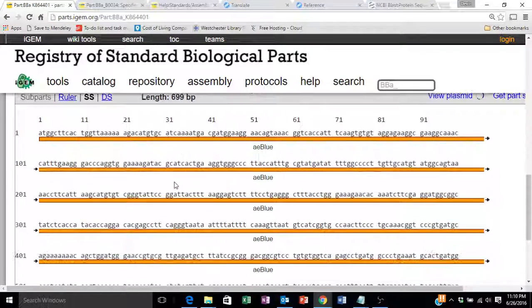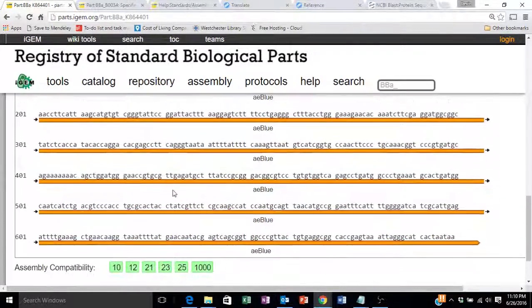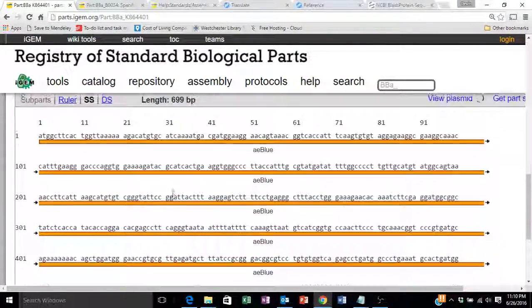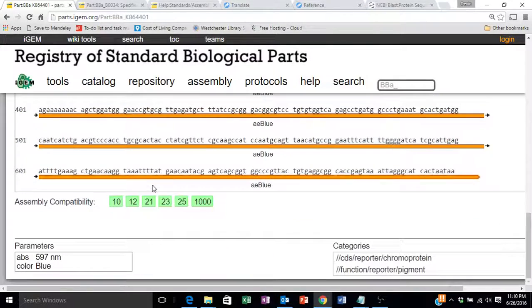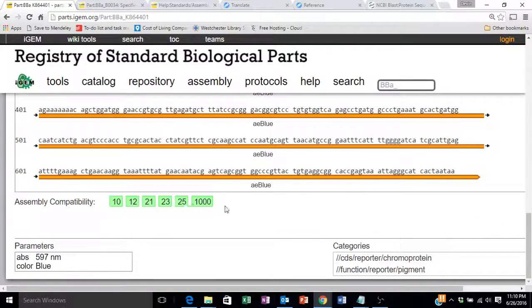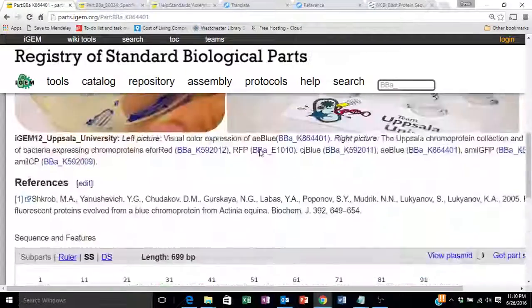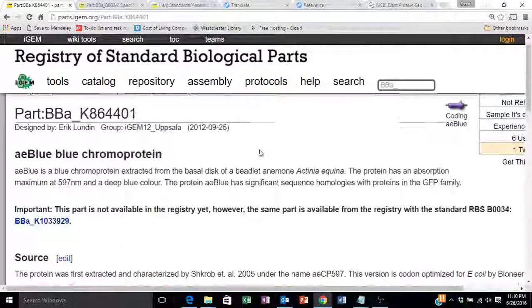We can look at the entire single strand DNA sequence. We get the compatibility of this part with other iGEM assembly standards.